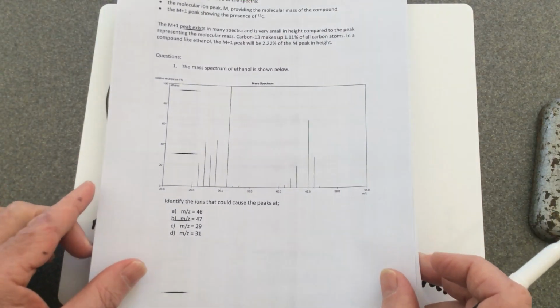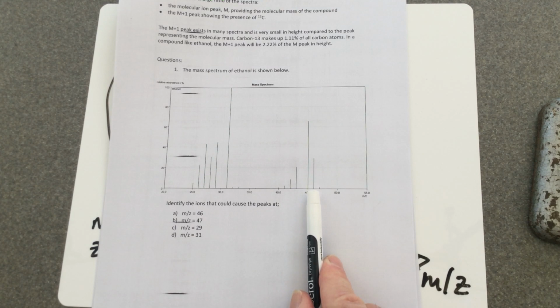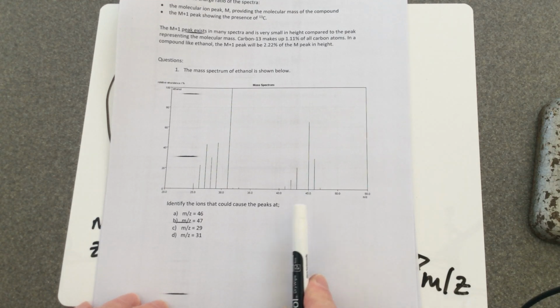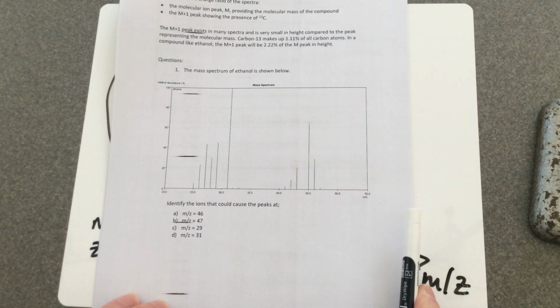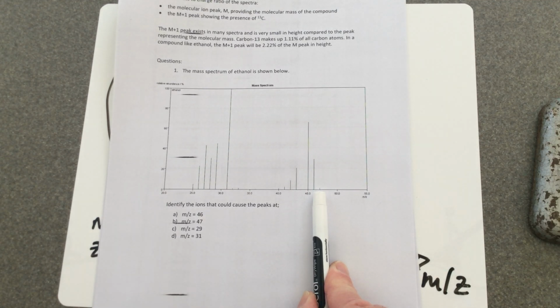So, if you have a spectrum that looks something like this, I can clearly see, looking at this spectrum, this is the one for ethanol. I have got a peak here at 46. It's not the biggest peak. The molecular ion peak does not have to be the tallest peak, but it is the peak which is the furthest up, which has the greatest MZ value, with the exception of the tiny, tiny peak which may be present at 1 unit higher in value.